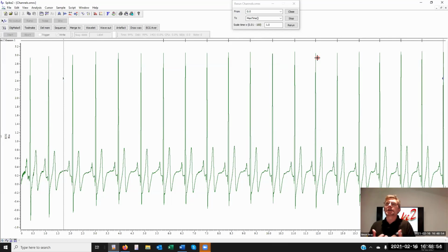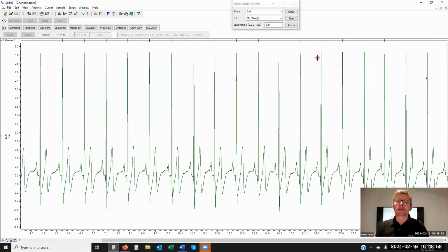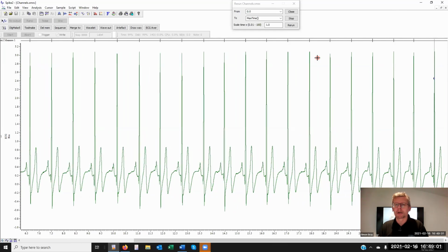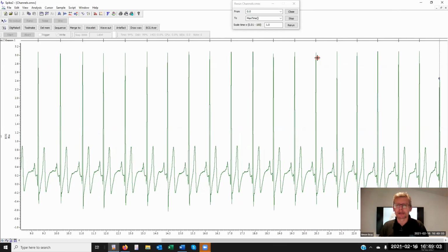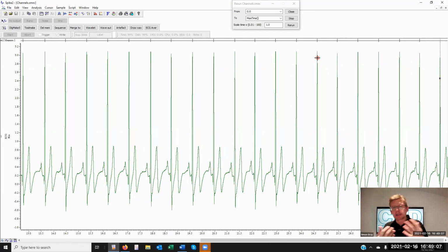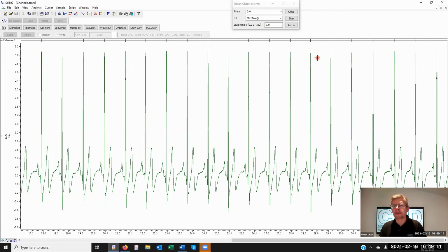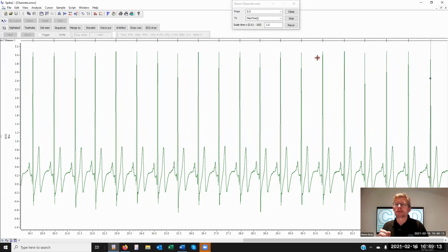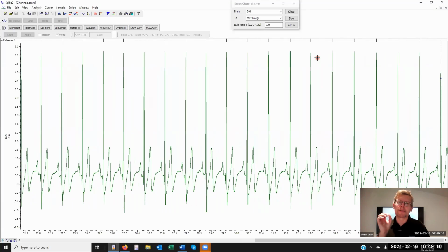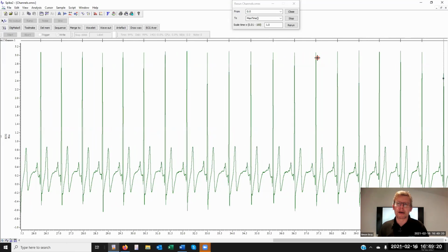Now, for the laser question, imagine now that you've looked at the power, a virtual channel, calculated on the fly. Waveform goes above a level, it peaks, some other variable has been matched, and then this cursor or a script can leave a marker there on the data to say, this is where I found the match.